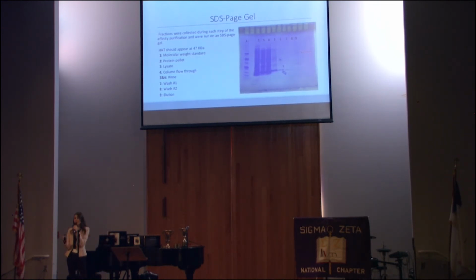But no, that wouldn't be on the SucB. So basically, SucB has some affinity to cobalt. And it also could be that we just produced so much of it because we were trying to purify HAT, and over our different processes we weren't getting the best results. So we just grew a ton of E. coli, and we think that either it has affinity to cobalt or it was just so much of this protein. That's what we ended up crystallizing.